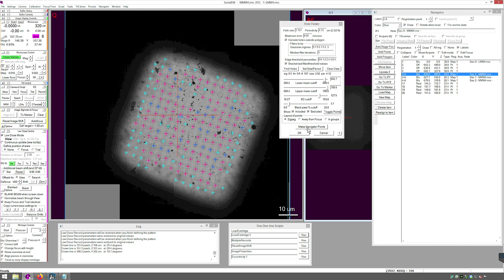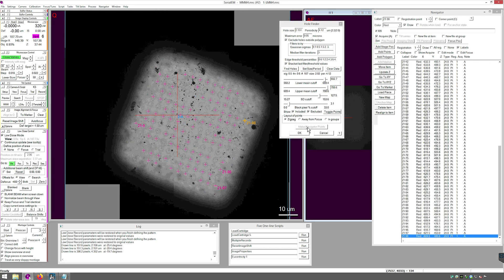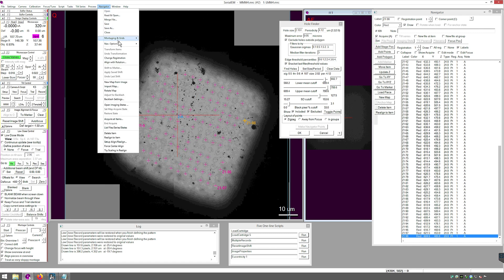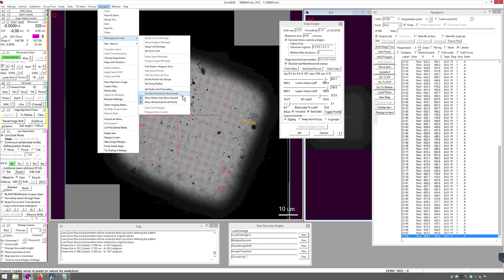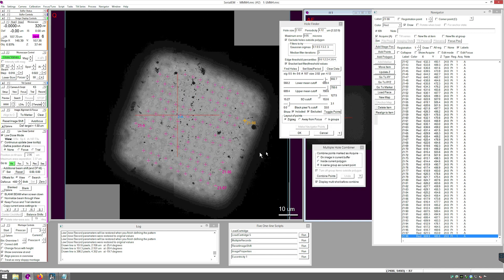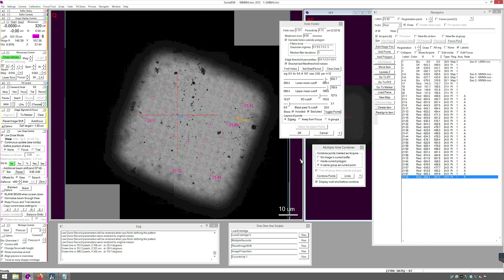Make Navigator Points. Then open the Multishot Combiner: Navigator, Montaging and Grids, Combine Points for Multishots. In Same Group as Current Point, press Combine Points. Now these positions have been optimized for Multishot.